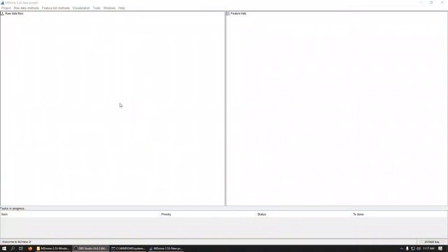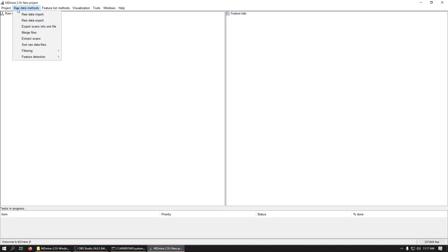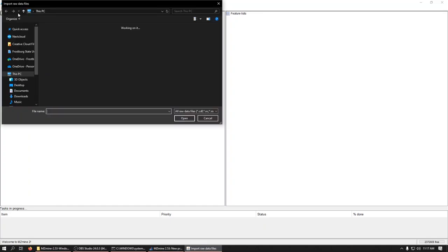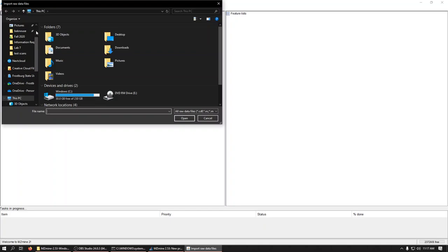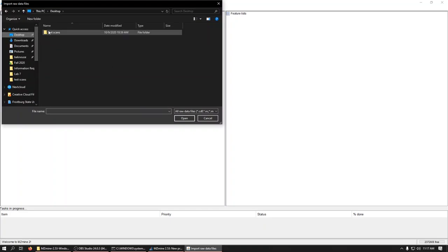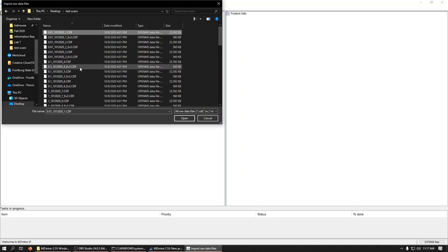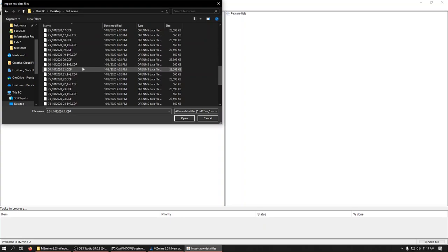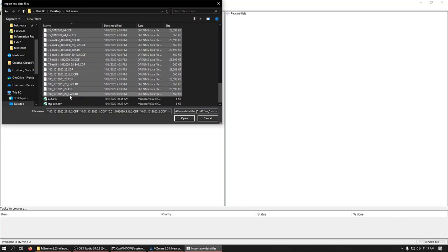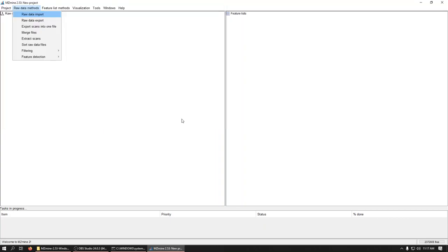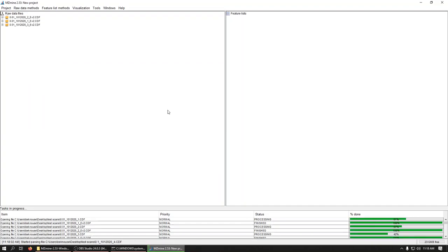Open up MZMine2. The first thing you'll have to do is import data. We'll go raw data methods, raw data import. You'll have to select where it is. Here I've got some example data. You'll see the two types of data that got exported from our method. It'll take a minute to chew through it.